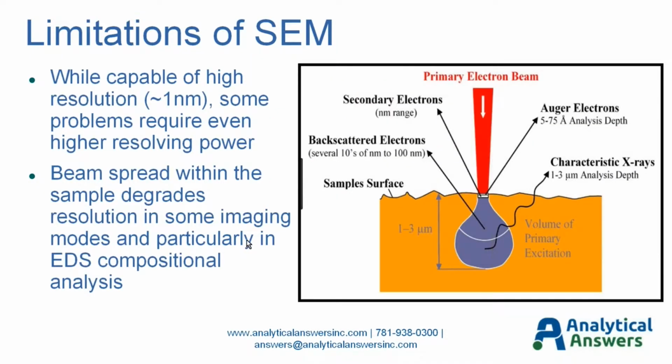Well, as powerful as it is, there are some limitations in the SEM. It's capable of very good resolution, down to about 1 nanometer spatial resolution. Some problems in materials require even higher resolving power. We like to see even finer structure and resolve those.